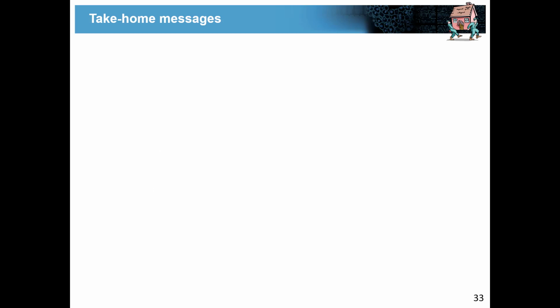Okay, so are there any more questions? This is just to give you a glimpse of how the data will look that you will also work with in the next days, and you will very often have to go through these criteria that I just showed you and decide whether this is the correct peak or not.